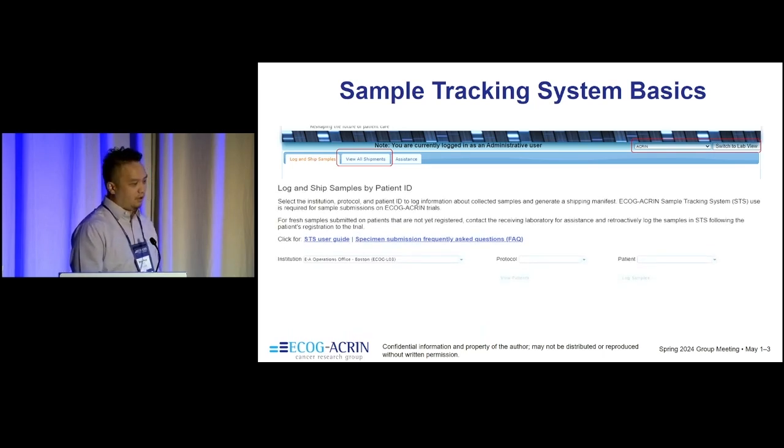This is kind of all in one page, but I just split it up a little bit here. For the next part, I know there are some people who are affiliated with multiple institutions. Make sure you are logged in and under the correct institution when logging samples.